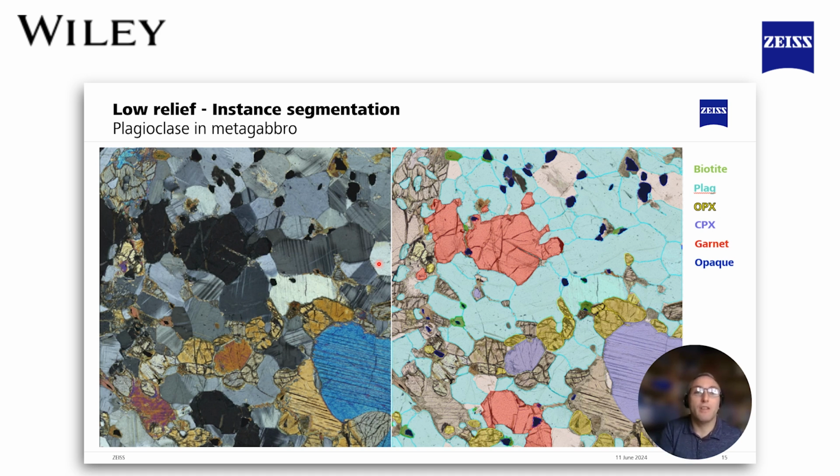So we're always looking at essentially the highest birefringence color that we would be able to get for that grain in our sample. But this is really useful for segmentation because when different grains of the same mineral in our sample are in different orientations, in extinction or not in extinction, being able to segment the same phase when it can look so different, black in one orientation and not black in another, makes it incredibly difficult to use that incredibly functional cross-polarized light information, which we use all the time as geologists, in an automated way.